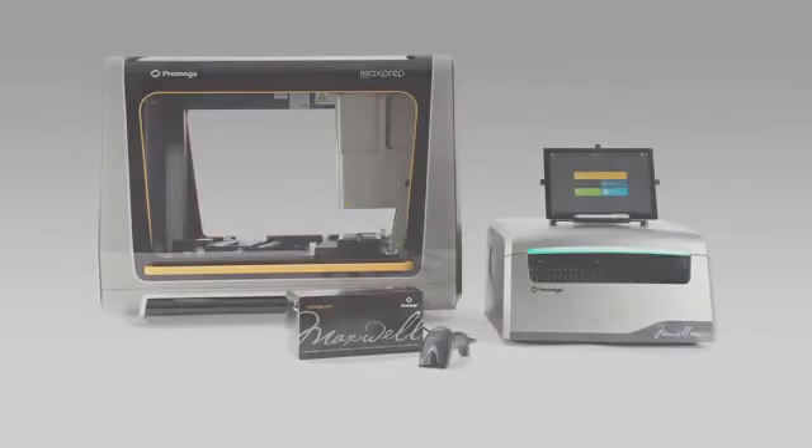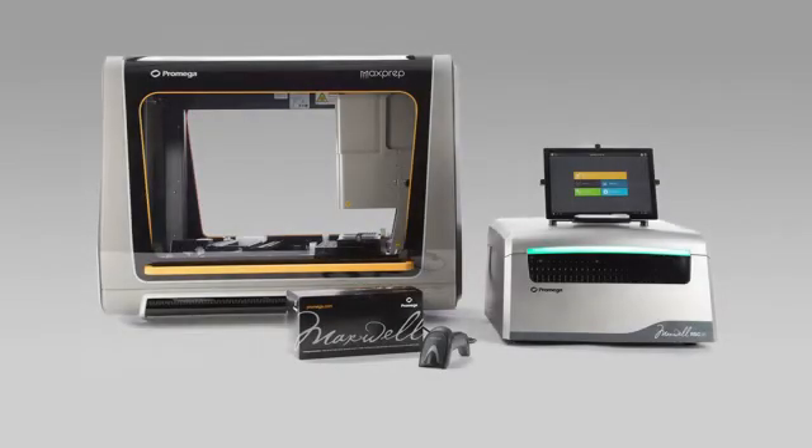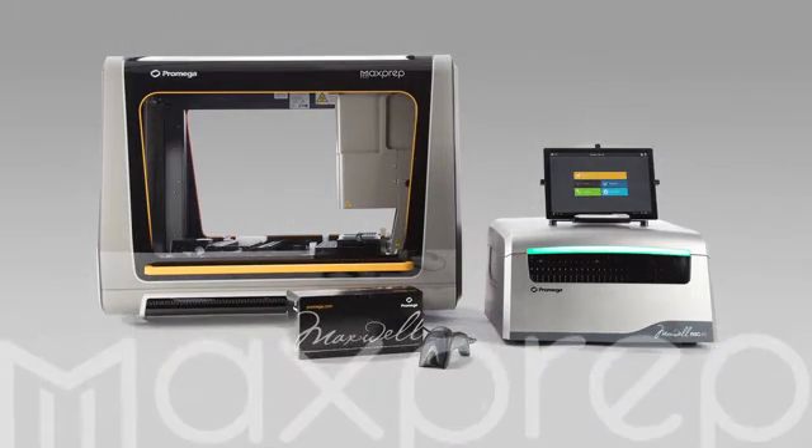The MaxPrep Liquid Handler and Maxwell RSC48 will help you meet growing throughput demands with increased automation and hands-free sample preparation.